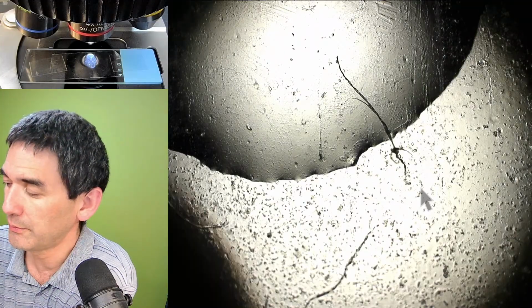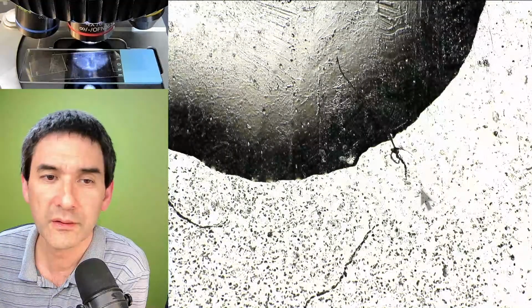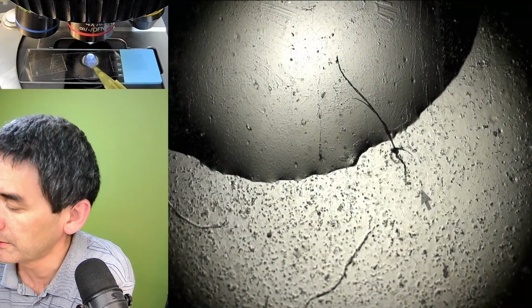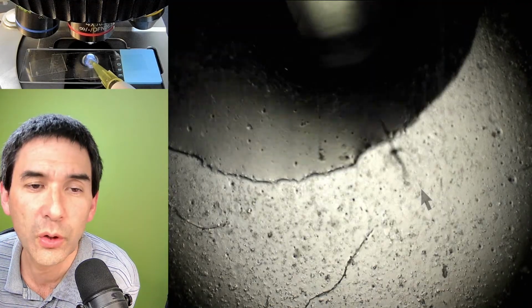And with the pipette, let me flip over the condenser again. It's difficult to see now. I'll be adding a little bit more oil, and then I would like to suck off.